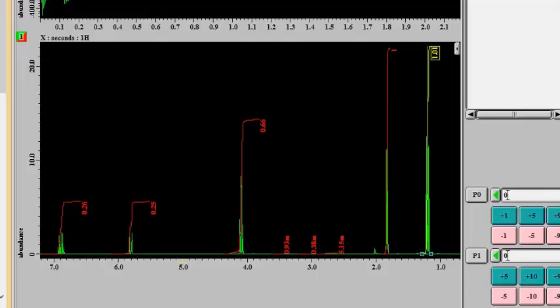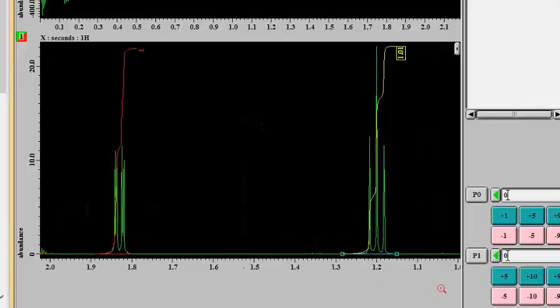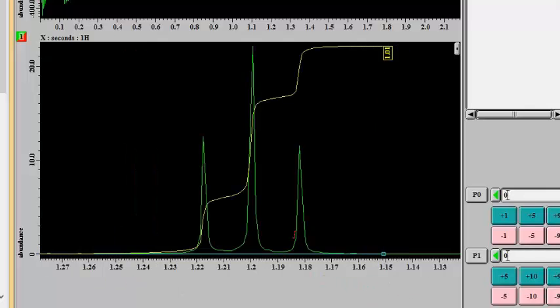Right there. Okay, so let's go back and take a look at the CH3 groups one more time. And the other very important feature in NMR spectra is the splitting pattern. Notice how this particular set of peaks is split into 3 subpeaks with a ratio. Turns out the ratio is 1 to 2 to 1. And we can prove that.